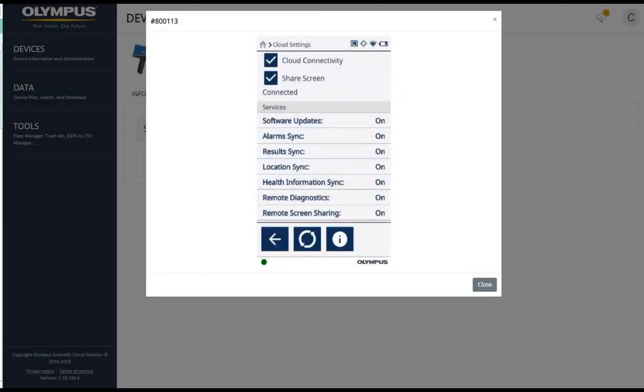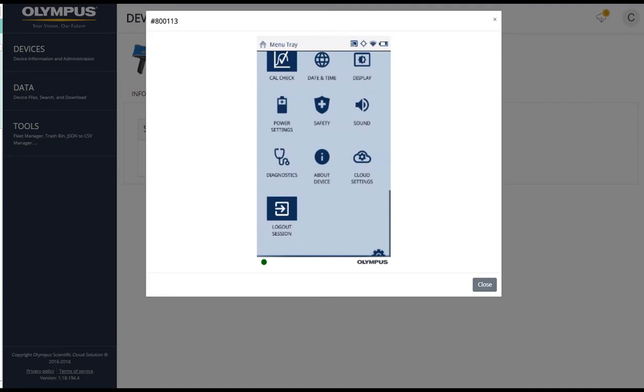You now have a live view of the instrument screen from the cloud as the user navigates the menu and performs tests.